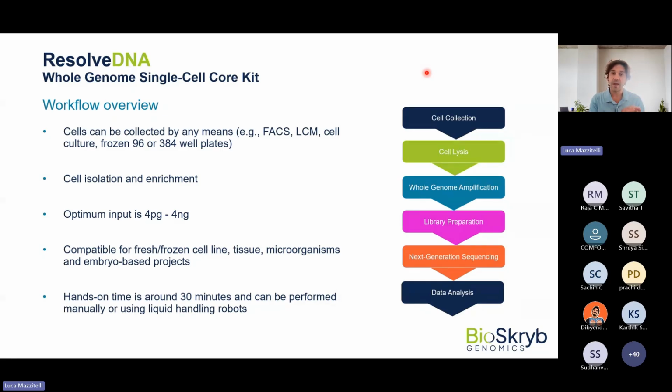Those cells have to be enriched. And for doing the enrichment, you will have to use a sorter to perform enrichment and isolation of single cells. So each single cell is going to be a reaction, the DNA is going to be amplified, and then one cell will be one library. So that's the switch in how you are thinking. We are thinking a low throughput, but with a very high resolution.